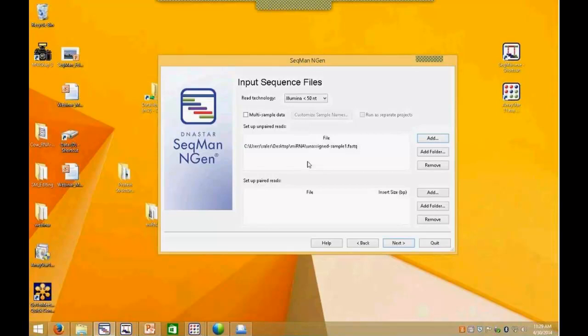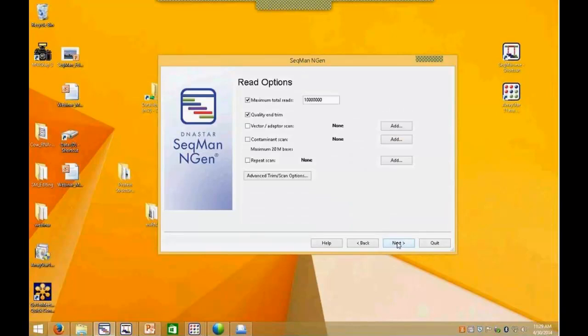So when I do microRNA, I'll set up 1 sample and really scale back the assembly and limit the number of input reads. So I might say, I want to take a look at this quickly. I'm going to do a pilot run of just 10,000 reads or maybe just 100,000 reads. And I want this to finish up within an hour and then go and look at the assembly and interrogate it and see, well, what's in this? Is it just a bunch of scraps of RNA that were in my prep? Would I have a not very specific prep, or do I have all microRNAs here?